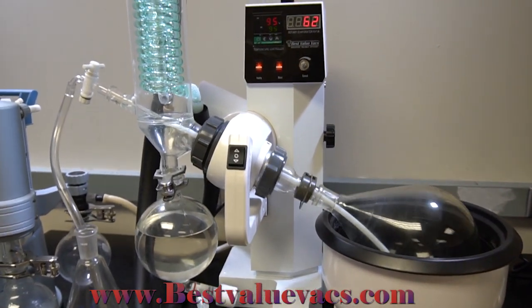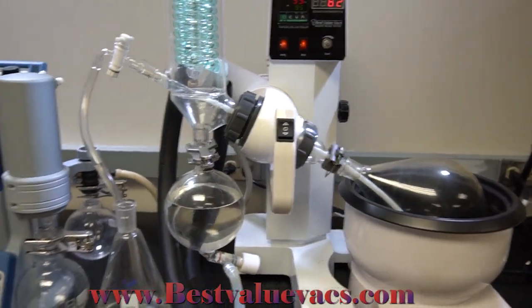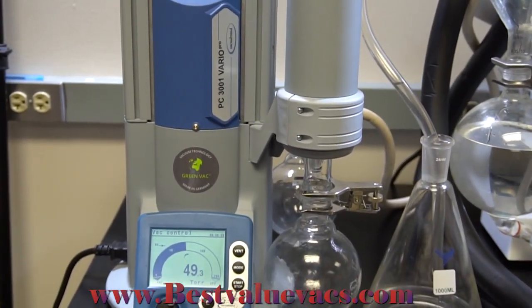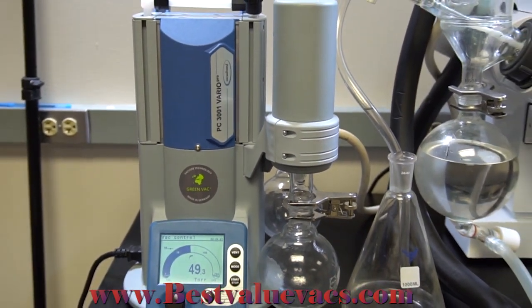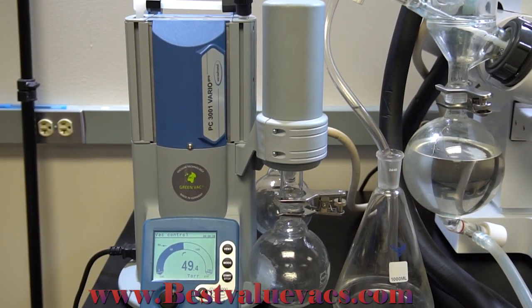Today we're here in the Best Value Vax testing laboratory looking at the VacuBrand PC-3001 VarioPro Pump. It's a four-head, three-stage diaphragm pump with a pumping speed of 1.2 CFM and an ultimate vacuum of 1.5 Torr.